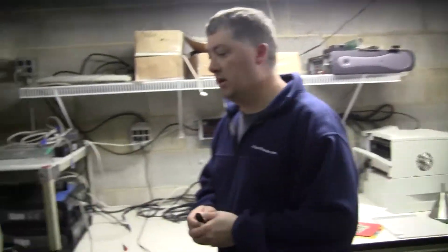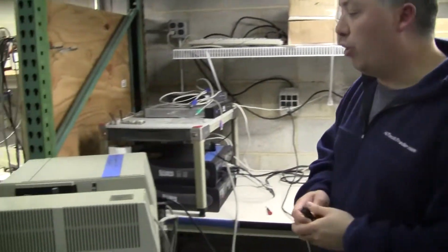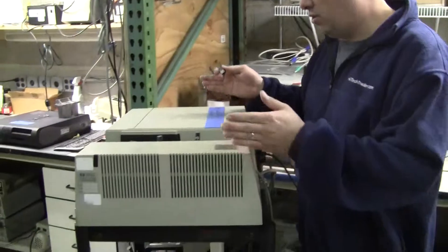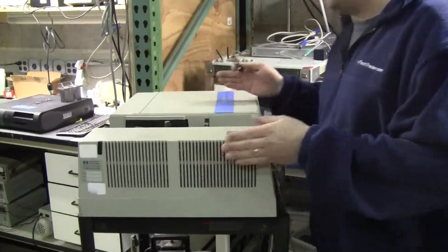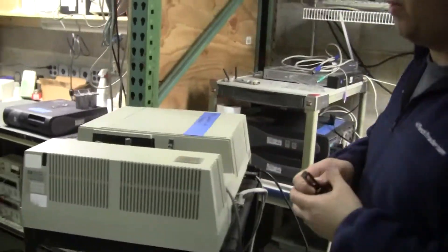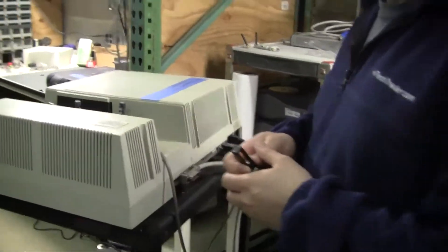Hi, this is Michael Naitow from Hitech Trader. Today we're demonstrating an older but useful photodiode array instrument from Hewlett Packard.